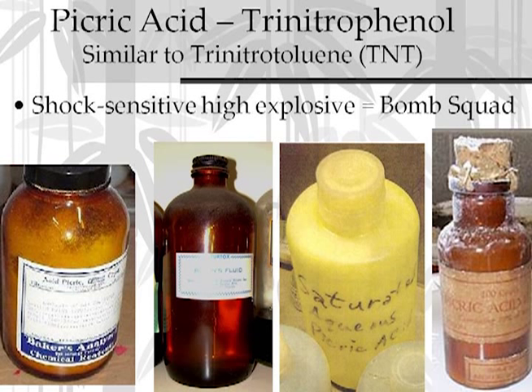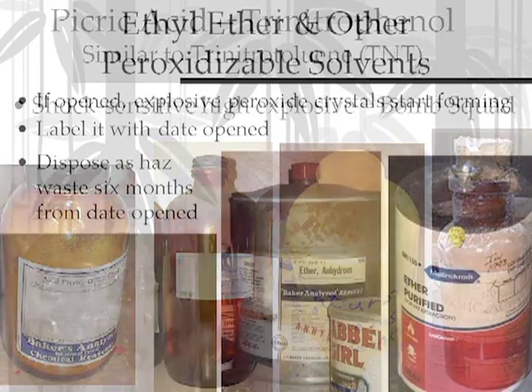And obviously, if you're in a classroom or a stockroom where there are a lot of other bottles of chemicals, the shock wave is going to be enough to break every glass bottle in the room, which has a secondary possibility of creating a chemical reaction that would carry the explosion into a fire or other types of problems.